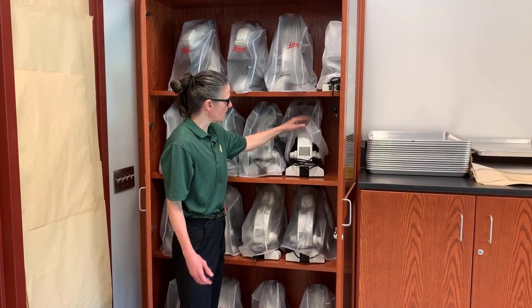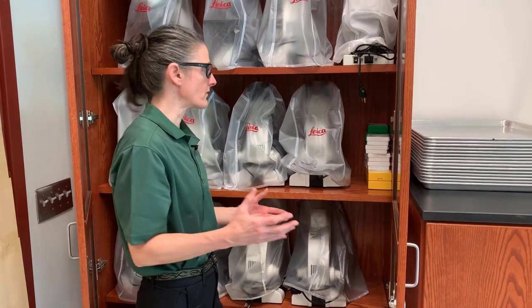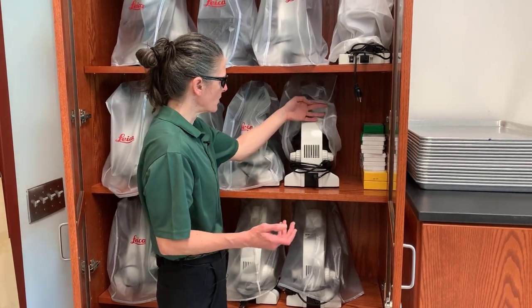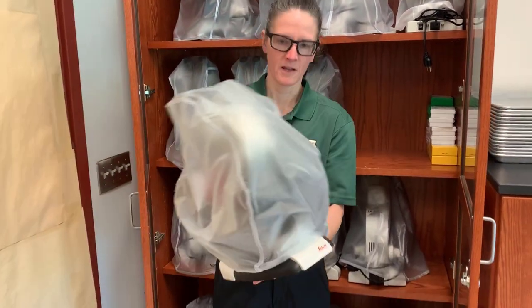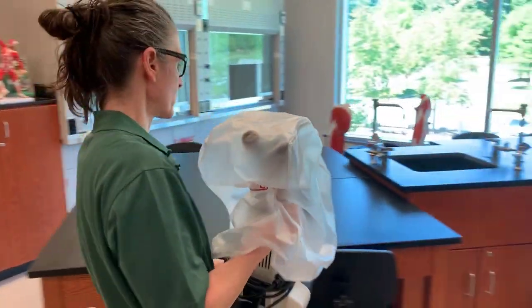You always want to grab it underneath the dust cover, not over the dust cover, because if you grab it over the dust cover, the dust cover is slippery and it can slip out of your hands. So we grab the microscope by this part here, which is called the arm, and we support it under the base. And we carry it like this to our station where we're going to work.